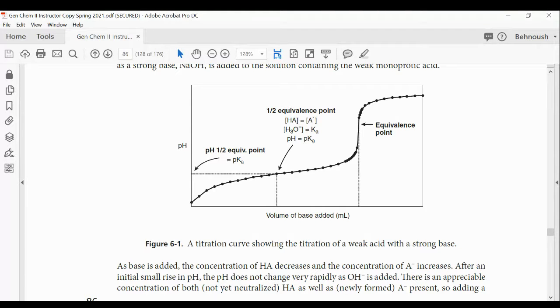When you have the titration curve or titration graph, then what? How do you use the graph? I'm presenting the graph now, it is on the board, being shared. Using the graph, what would be your next step?